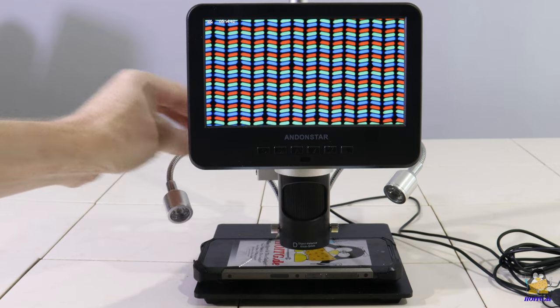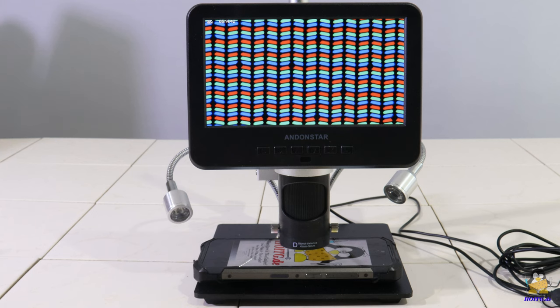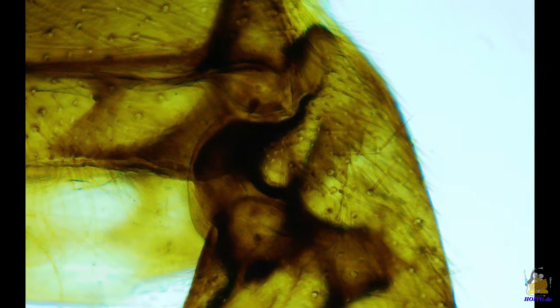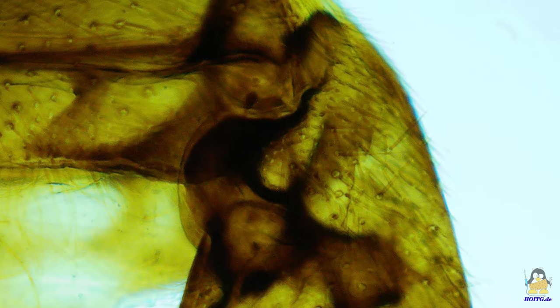And 15 pixels on the smartphone screen. With this lens let's take a look at the sample preparations.